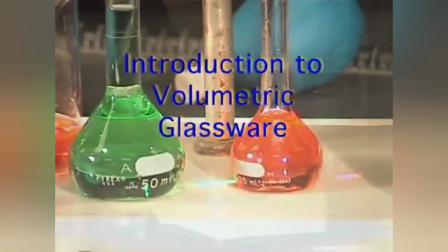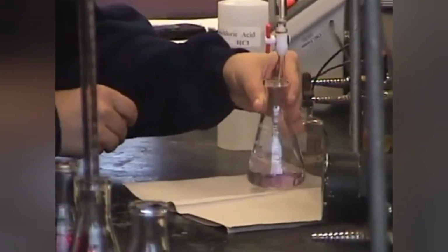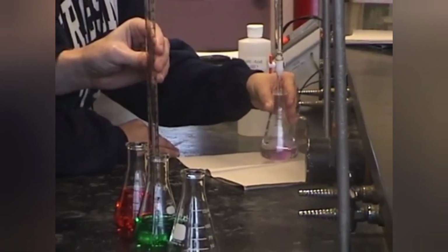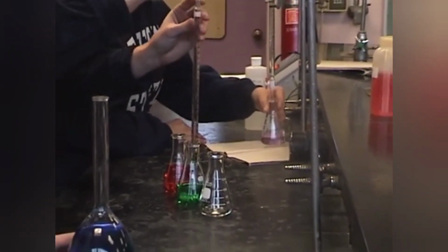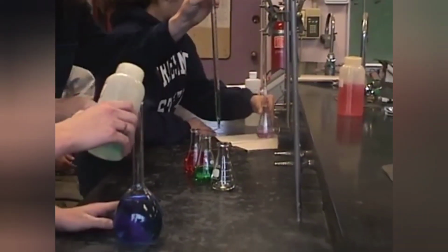Pay attention, alright? When chemists analyze solutions to learn how much of a certain substance is present in a sample, they may use methods of volumetric analysis. These techniques involve the careful measurement of sample and reagent volumes. The most common types of glassware used for volumetric analysis are the burette, the pipette, and the volumetric flask.